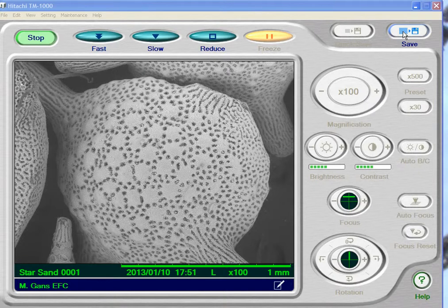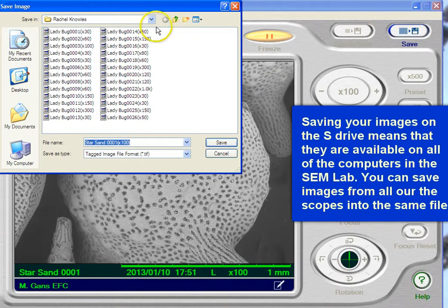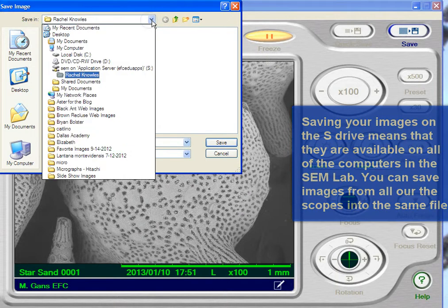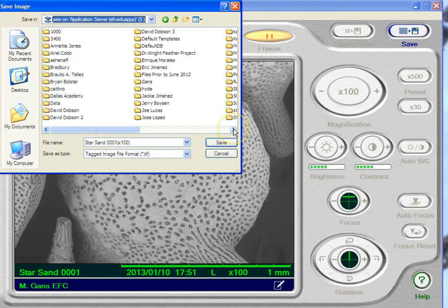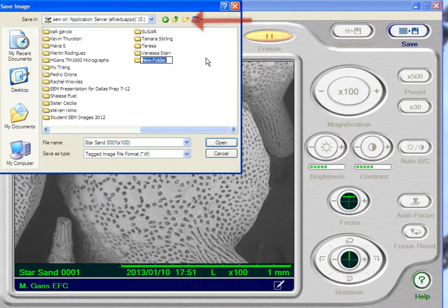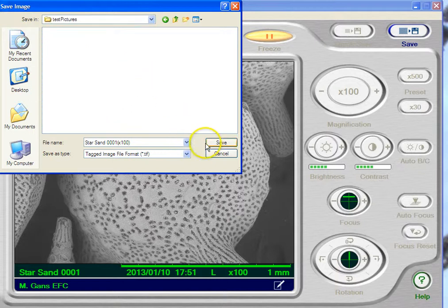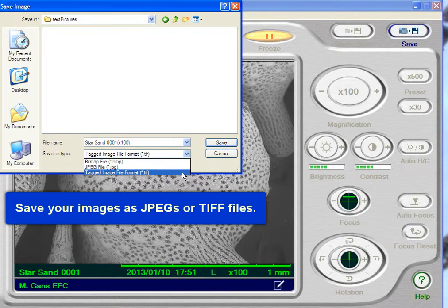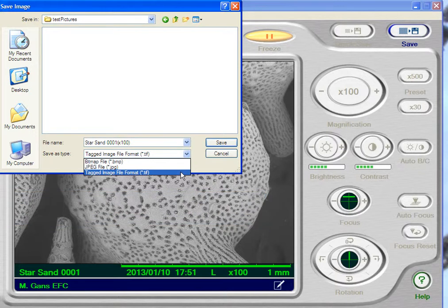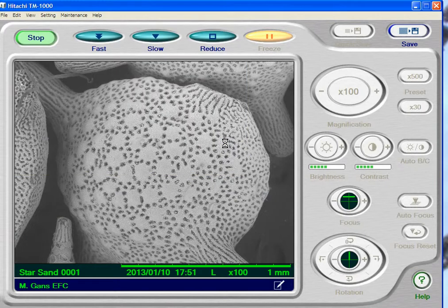Our image has been saved, and it's going to ask me where I want to save it. We always want to save our images on the S drive — the SEM drive. So I'm going to use a dropdown, go to the S drive under My Computer — the SEM on Application Server S. If you have a folder, great; if you don't, go up and create a new folder. Call it Test Pictures. I'm going to open that folder and dump the image right in there. Notice it's already got our name — we put Starsand, so it's got Starsand 001, our first image. It also includes the magnification, which is really nice. There are three ways to save an image: bitmap, JPEG, or TIFF — Tagged Image File Format. You want TIFF; TIFF is a higher quality picture, and you can reduce it down in Photoshop later. So I'm going to pick TIFF and save the picture.